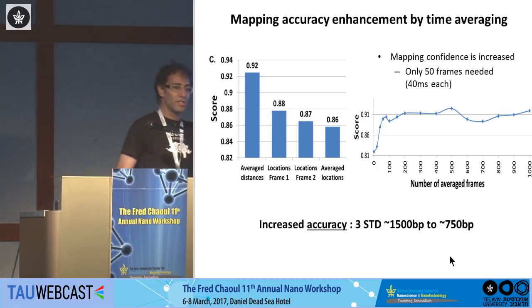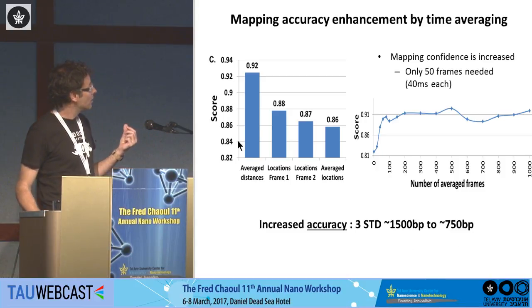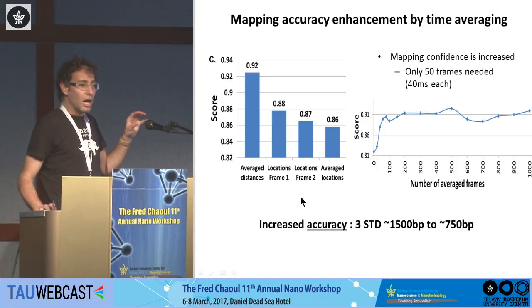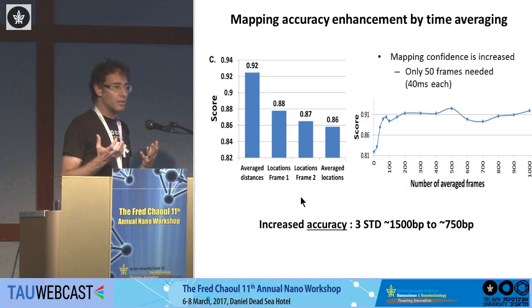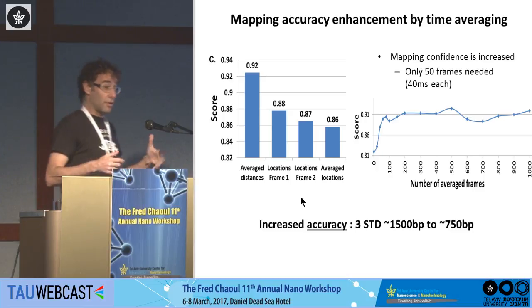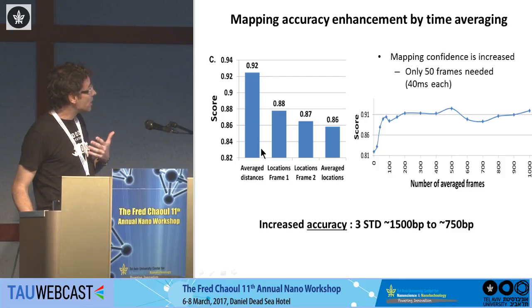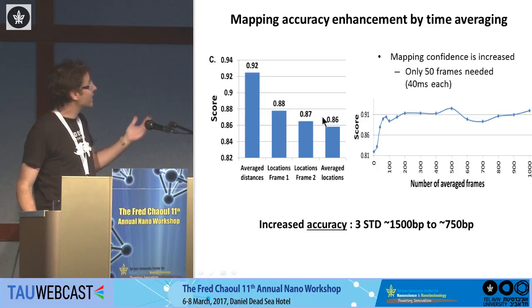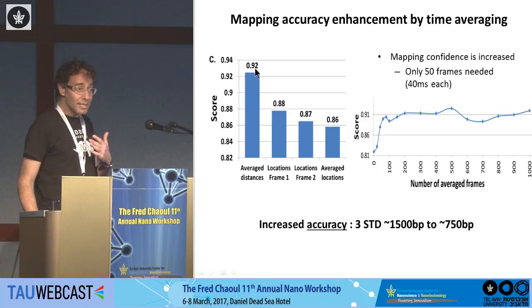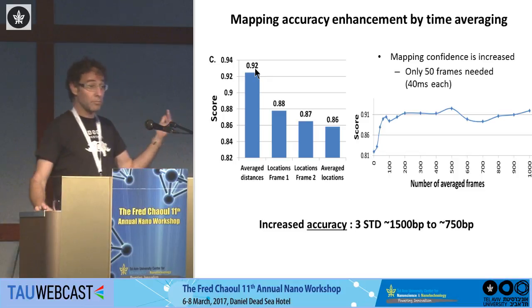Of course, if you're taking movies instead of snapshots, there's a price to pay. And the price is time. So the first thing that we checked is, we checked two things. First of all, is this improvement worthwhile? Is it giving us better results? And this can be easily done just by doing cross-correlation between the theoretical pattern of dots that you're expecting and what you get in the experiment. And you can see that after this averaging procedure with distances, the cross-correlation between the theory and experiment is really boosted up. The difference between 0.88 and 0.92 for us is extreme. Okay, it means that we need much less data in order to achieve the same genetic conclusion.